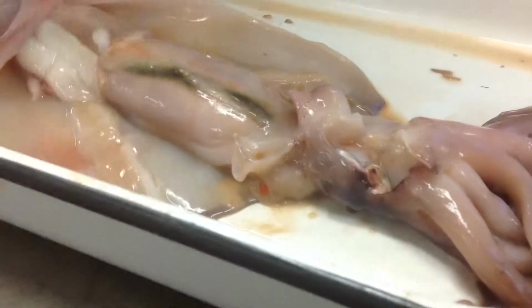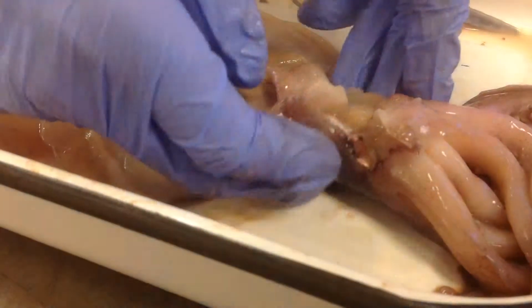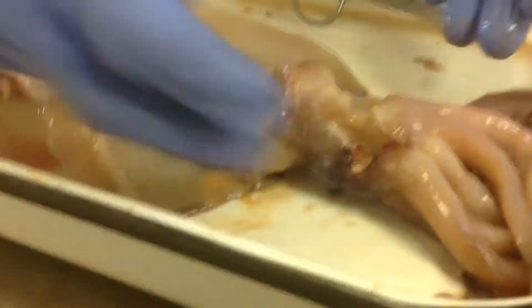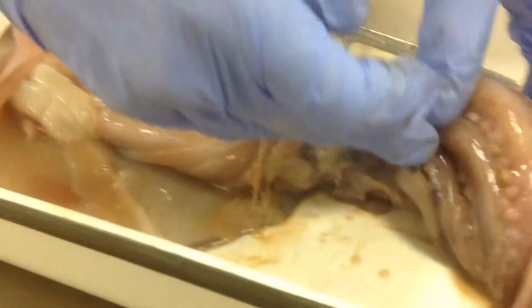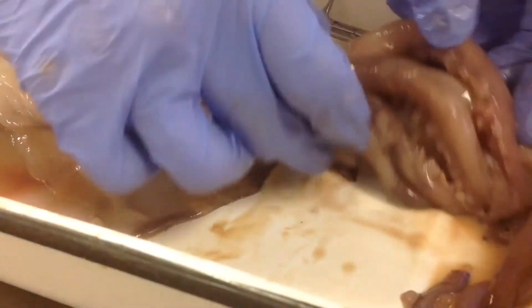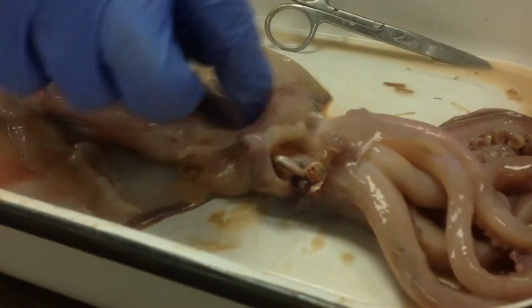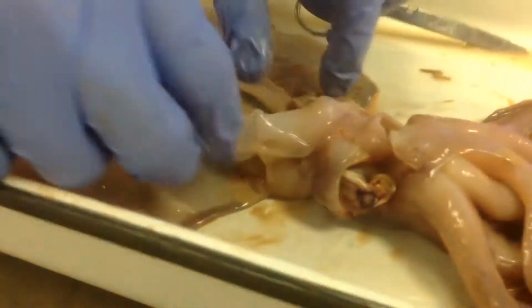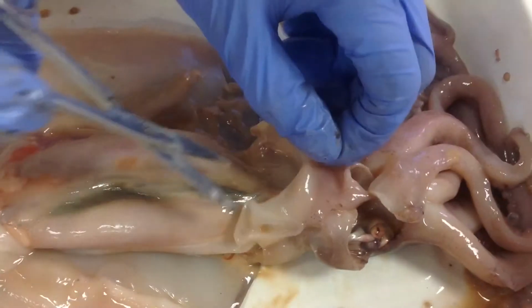I'm guessing the brain is actually a small entity right behind here. There's kind of another bit of cartilage on the back side, and this is probably the skull cap. I'm not sure the best way to enter the brain. We might want to remove the head altogether, but let's try and look at this line here that we were seeing. Let's see. Figure out what this black line does.